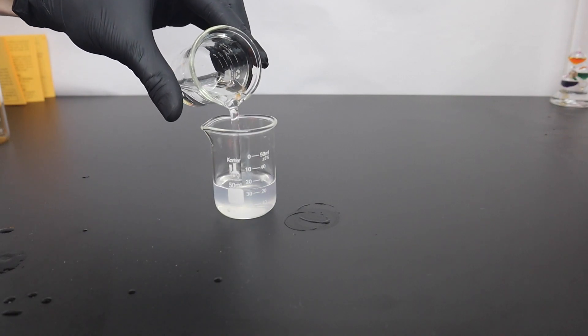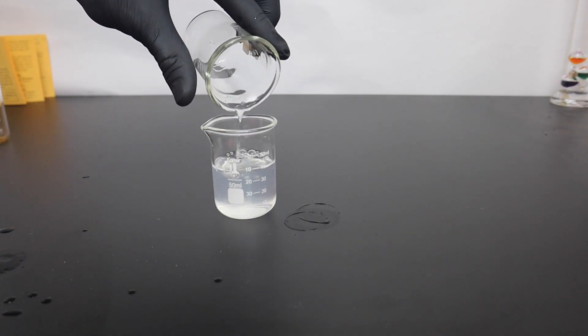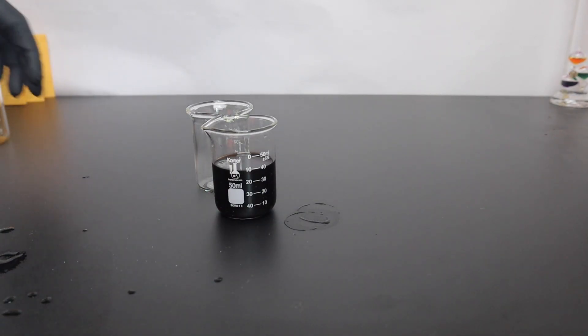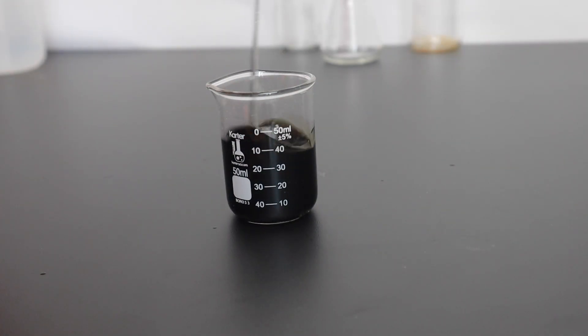Both solutions were stirred properly and mixed together. It's a bit of simple dark magic. Now what if I don't want it to be black anymore? Well, to turn it clear again I added a bit of sodium thiosulfate and gave it a long long stir.